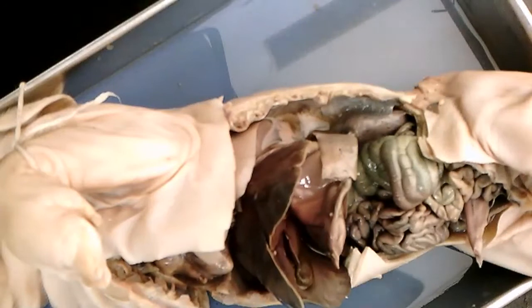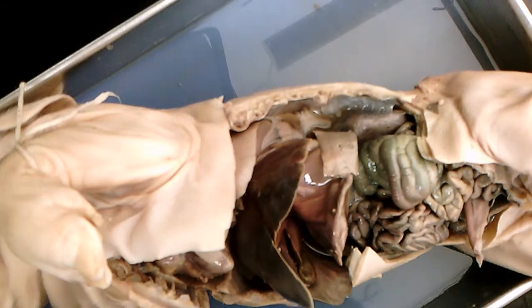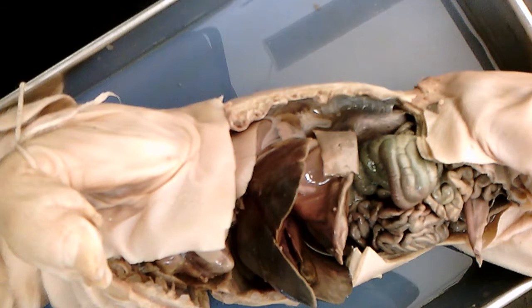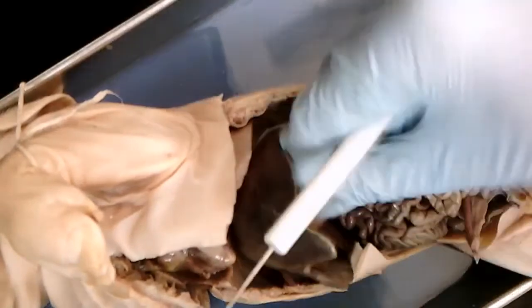What about the gallbladder? It is attached to this, I believe. Is that an identified organ? Yes, the gallbladder. Let's see where it is on my list. I always look back at that. So the gallbladder is immediately underneath the liver. It's normally embedded in its underside. So it's often greenish in color. So you have the liver. I'm looking for the gallbladder.